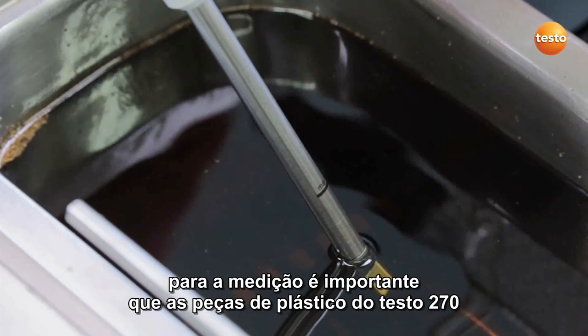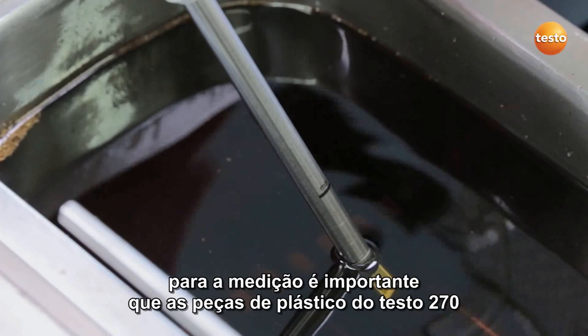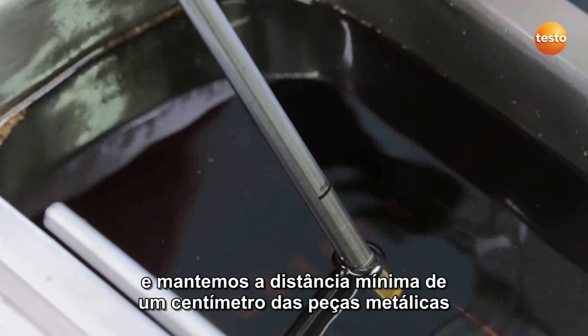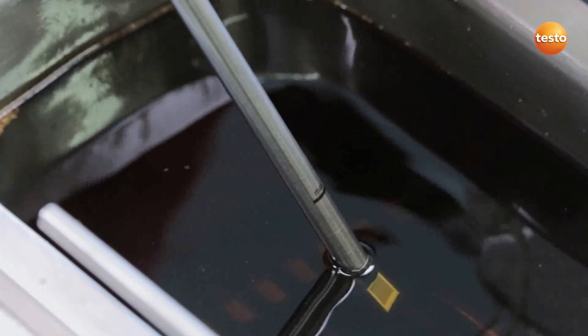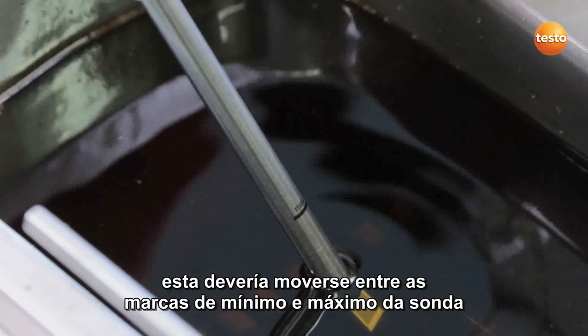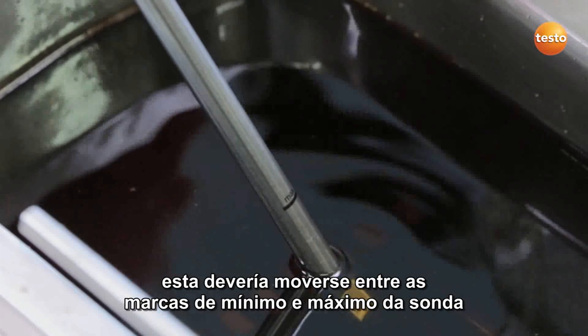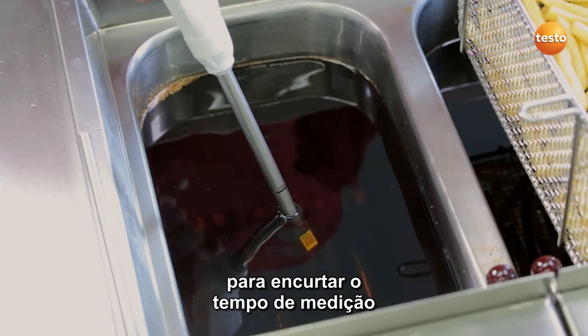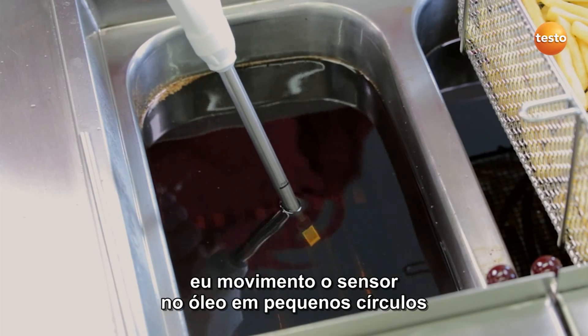For the measurement, it's important that the plastic parts of the Testo 270 don't come into contact with the oil, and that I maintain a minimum distance of one centimeter to metal parts. The right immersion depth is also important — this should ideally be between the minimum and maximum marks on the probe. In order to shorten the measurement time, I move the sensor in small circles in the oil.